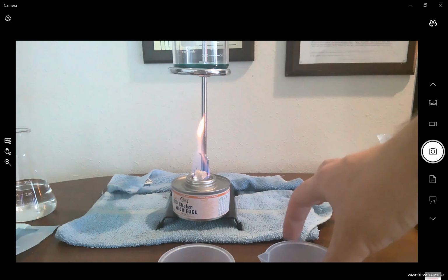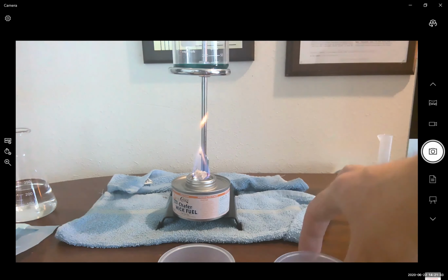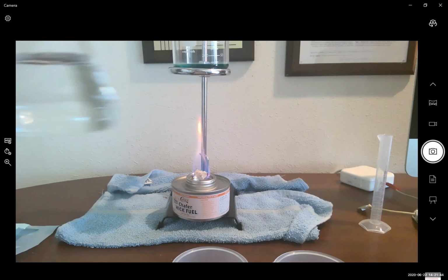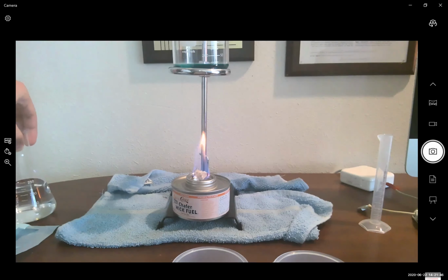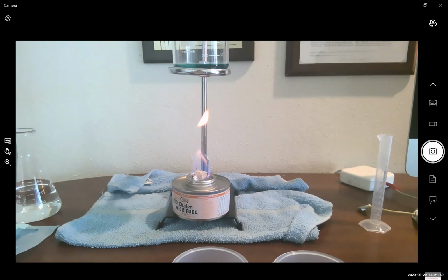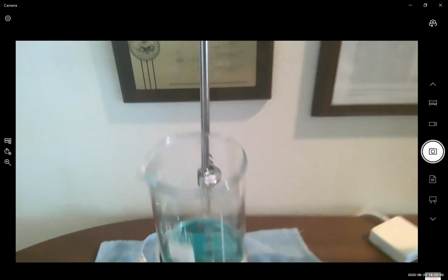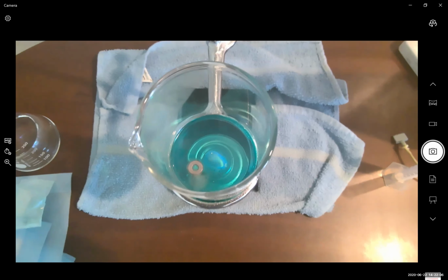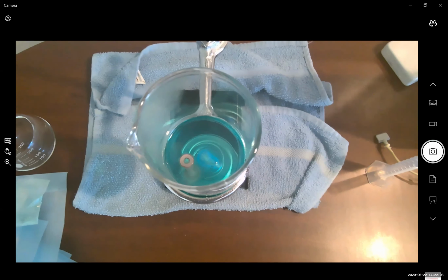Again, in terms of materials that we'll prepare, we want 2 beakers. We want to have our cup ready to go, our forceps ready to go, and some deionized water ready to go. Yep, the darker one is reacting. This reaction's buzzing along quite well. And we actually see that our second washer is slowly being reacted, and you can see substantial amounts of copper generated.